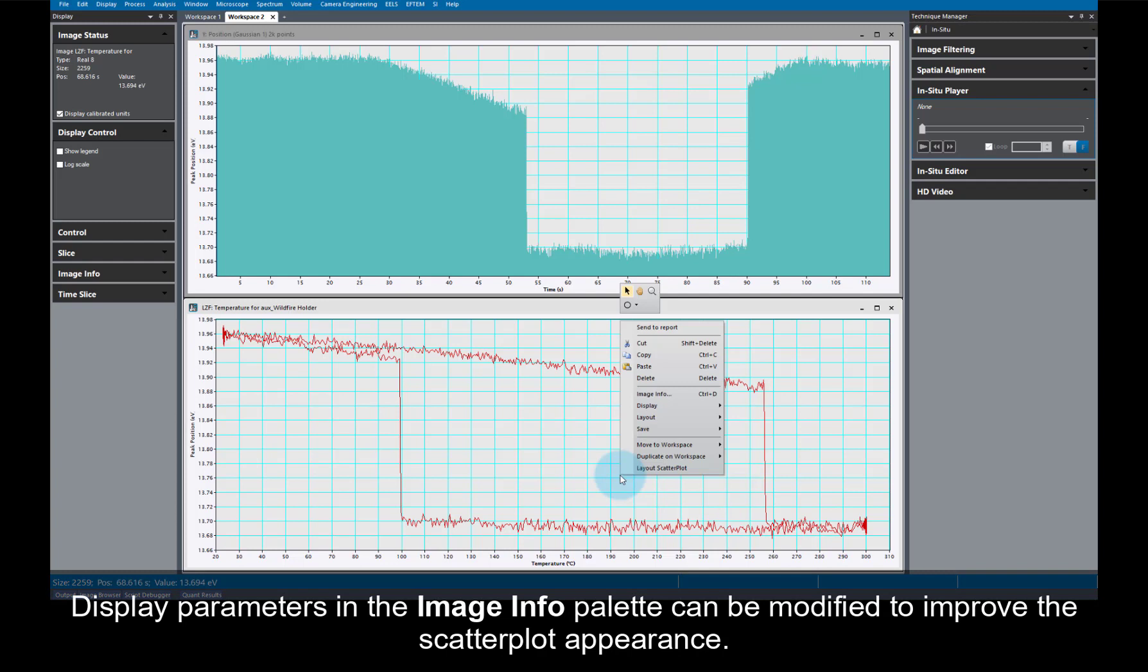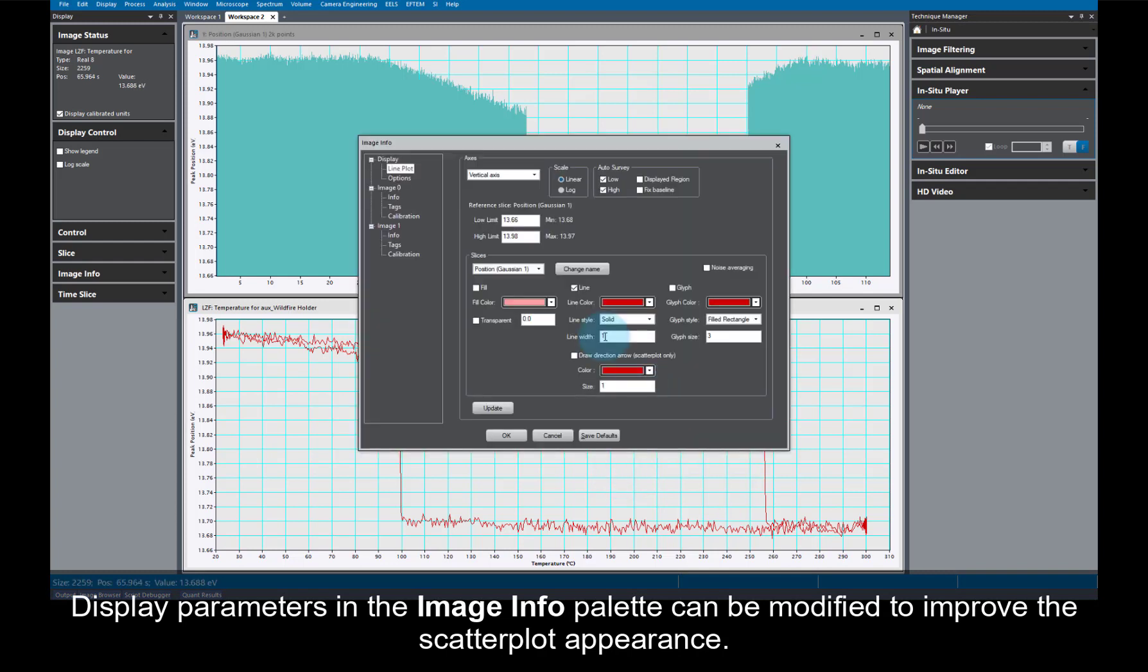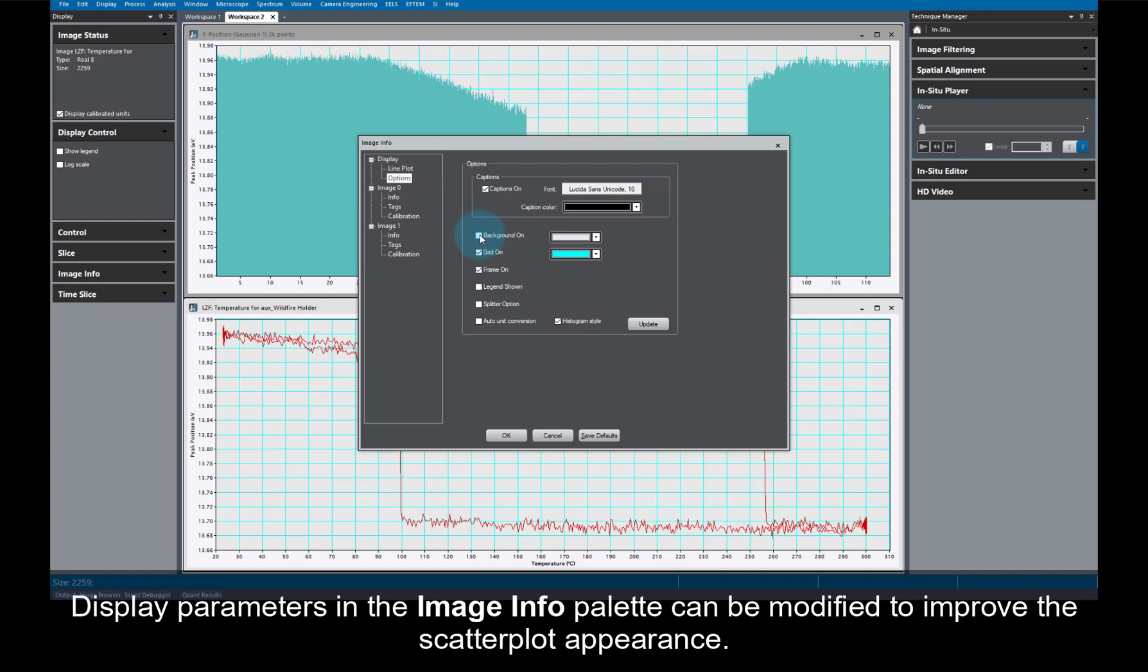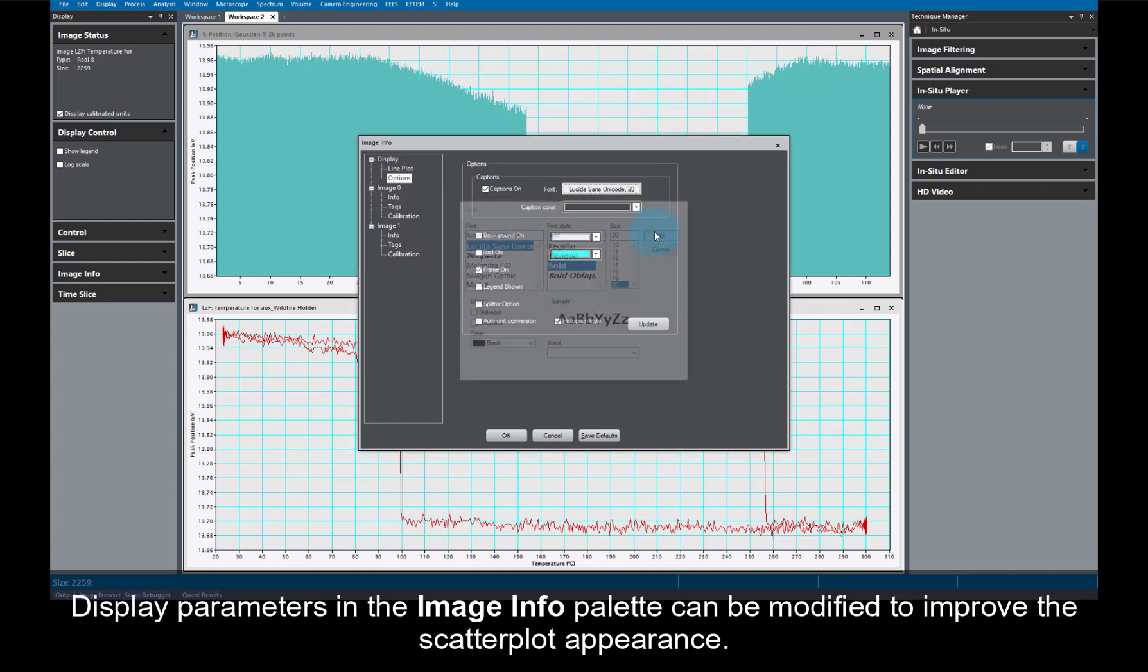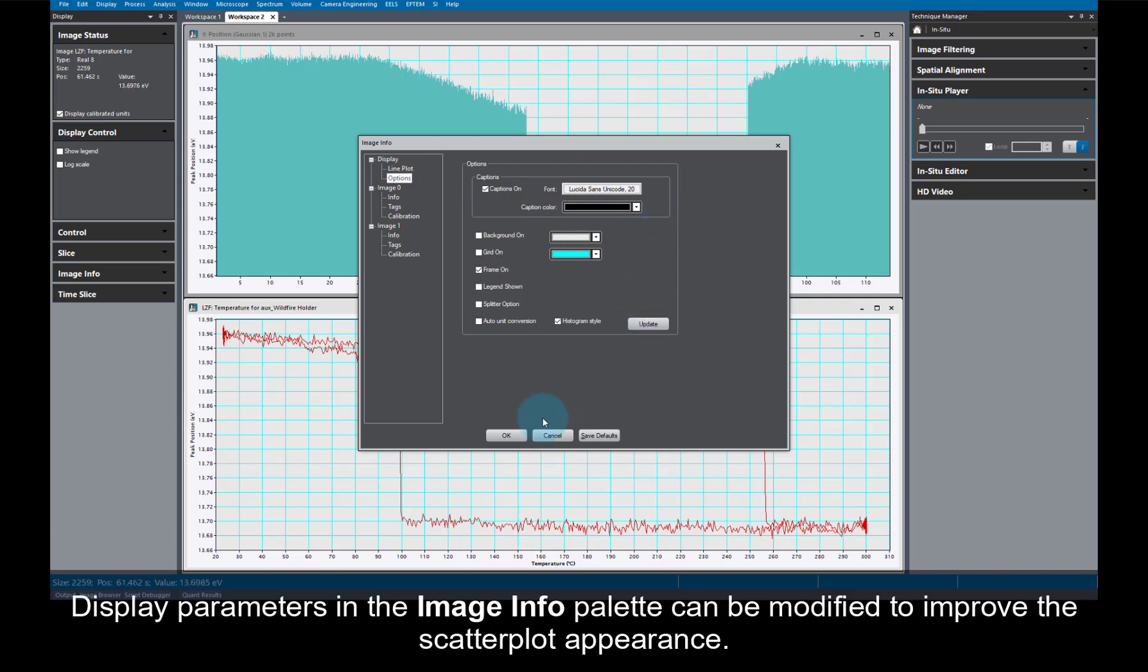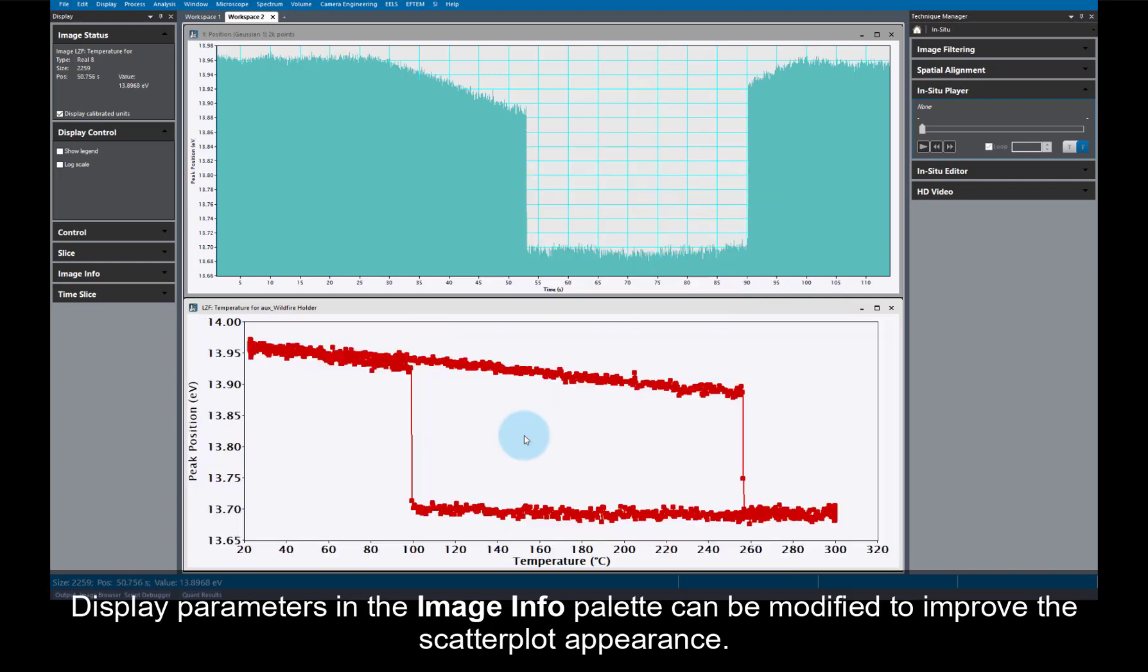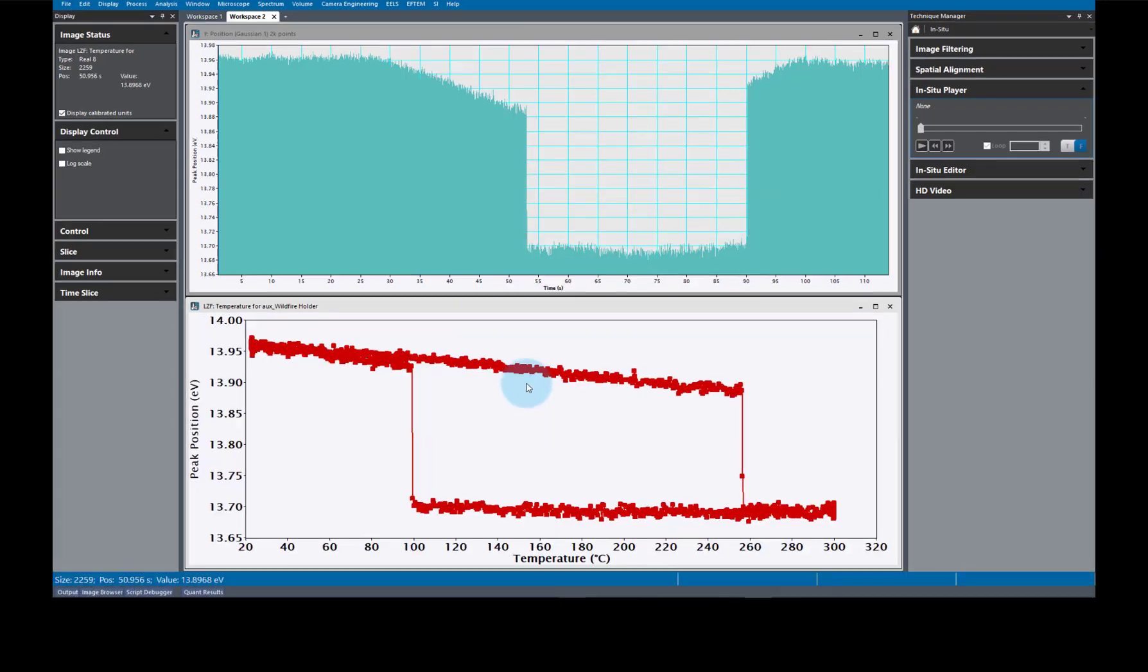Next, if you want to make it look a bit nicer, you can change the display parameters in the Image Info Palette to improve the appearance. You can change the line parameters, or add glyphs, or markers as they're also called. And you can also change the fonts used for the axes, as well as the background and grid settings.